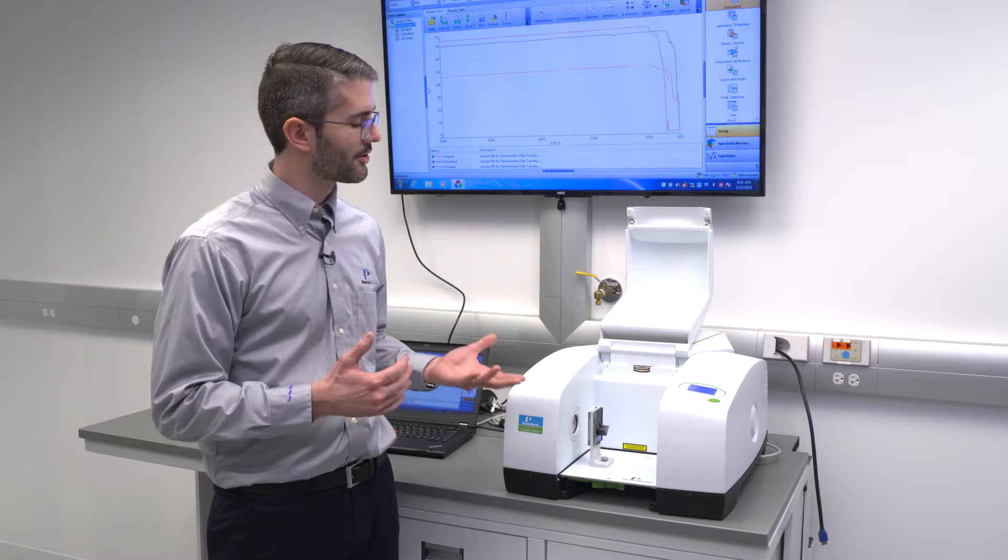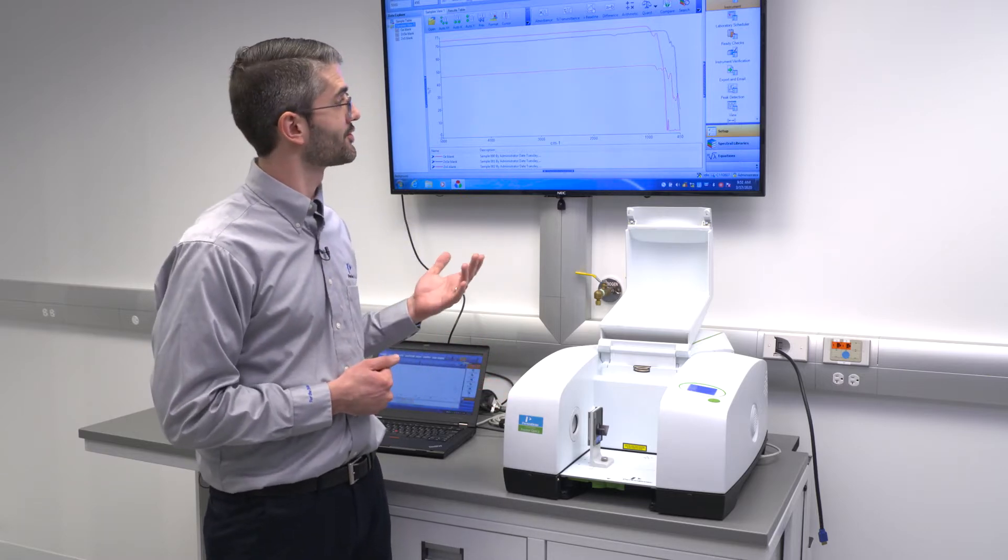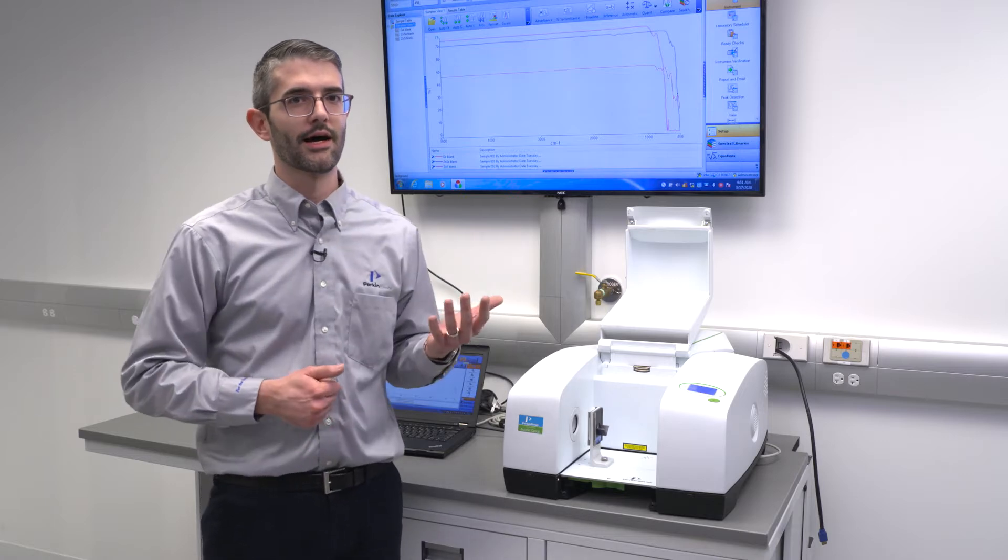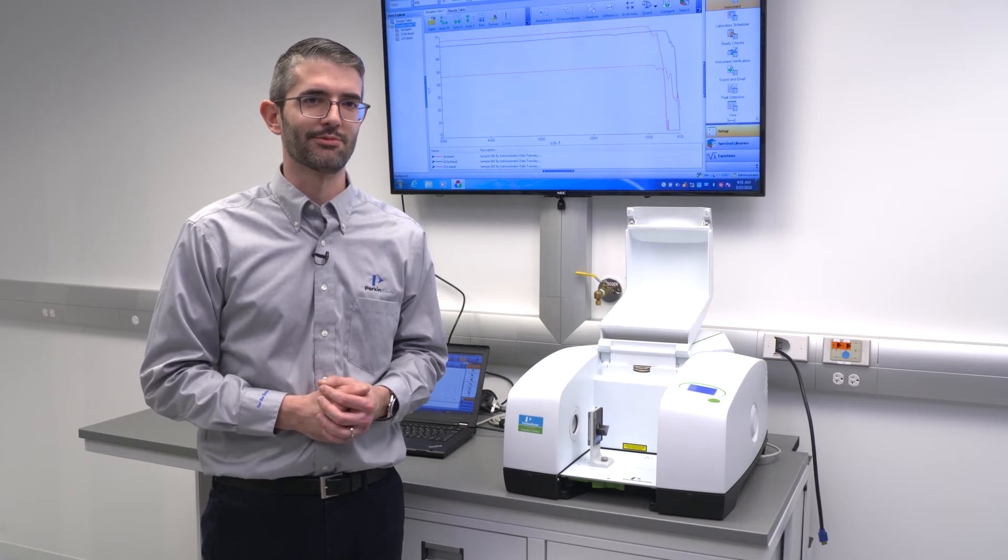However, the Frontier Optica incorporates a series of hardware features which are also controlled within the software interface, allowing optimization of experimental parameters to achieve optimal accuracy in transmission measurements.